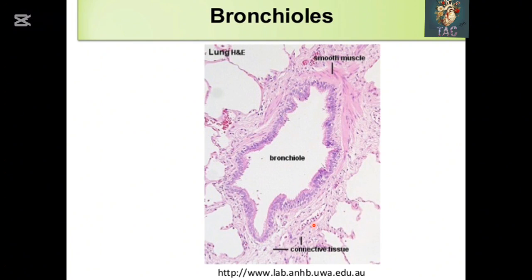So this is the section of the bronchiole which is lined by simple columnar epithelium which is ciliated in nature, surrounded by very little connective tissue and then the smooth muscle cells, and outer to the smooth muscles, as you can see, the lung tissue which is present.